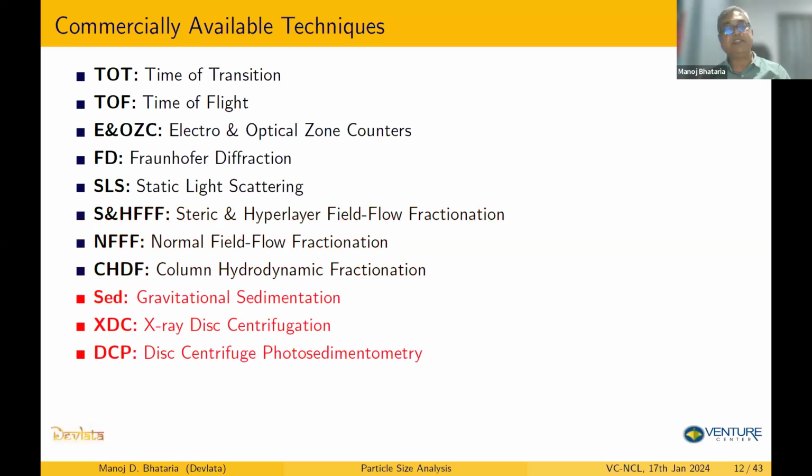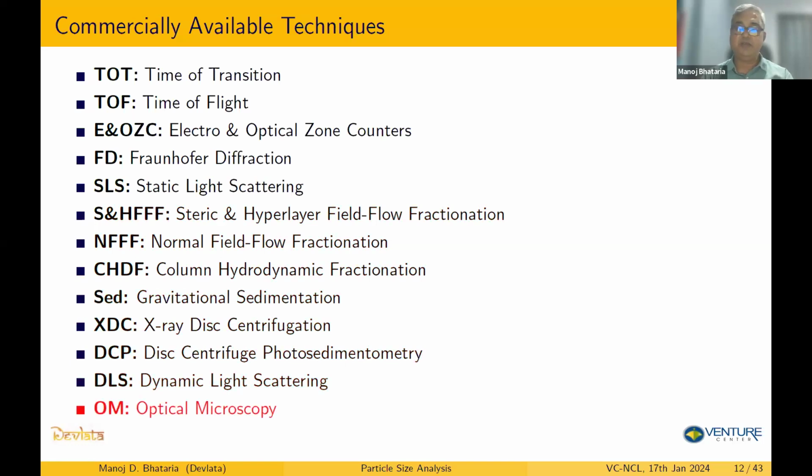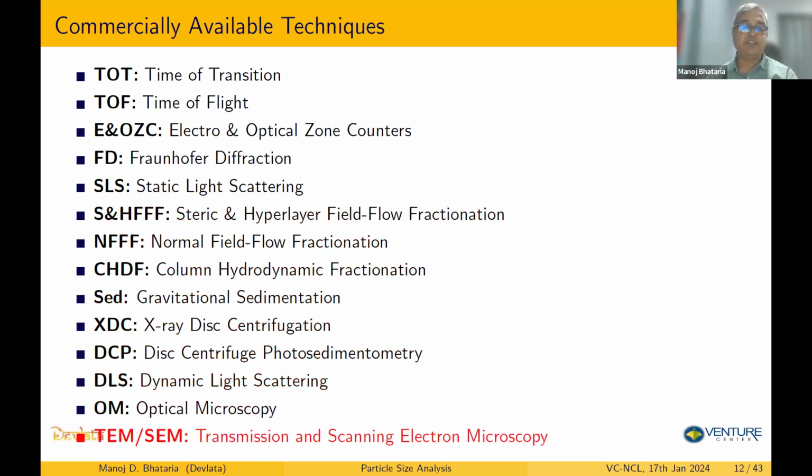Okay, then we have the sedimentation techniques. Some simple gravitational-based as well as using centrifugation, and then we come to microscopy. So in microscopy also we have basic optical microscopy, and then you have the more high resolution and for lower sizes, TEM and SEM.